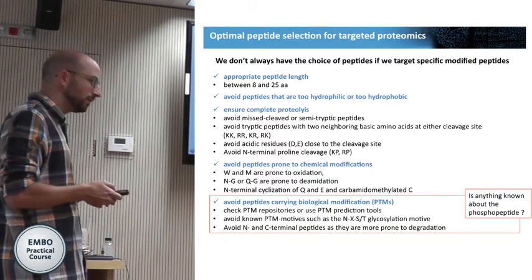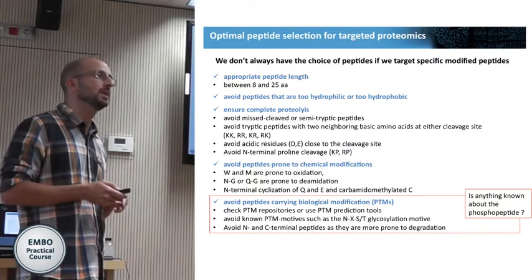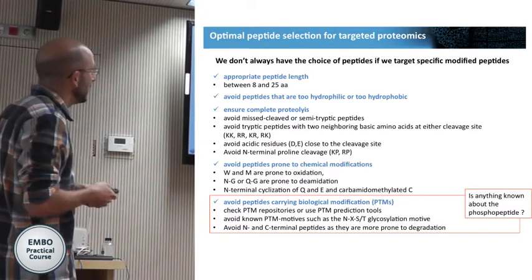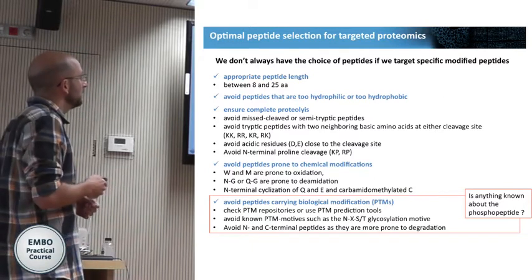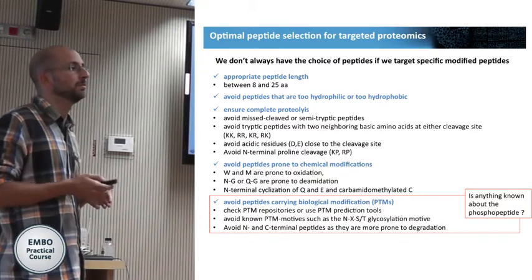Now, there are different considerations that we apply when we think about quantifying proteins, and they vary a bit when we think about quantifying phosphopeptides or modified peptides in general. You already saw a similar slide from Edward, you saw a slide from Tina. We try to apply different considerations when we try to choose proteotypic peptides for quantification of proteins.